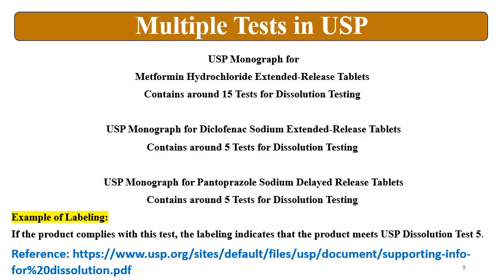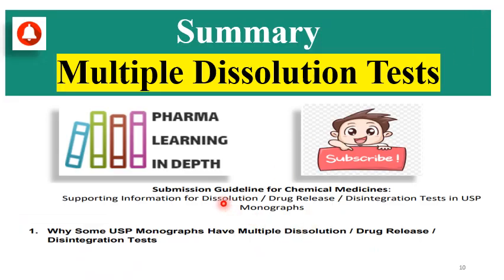This is the example. And the reference for this presentation is taken from the Dissolution Submission Guideline for Chemical Medicines, supporting information for dissolution, drug release, disintegration test in USP monograph. So if you download this article, you can get the information easily and you will have an in-depth understanding of the multiple dissolution tests in the USP.